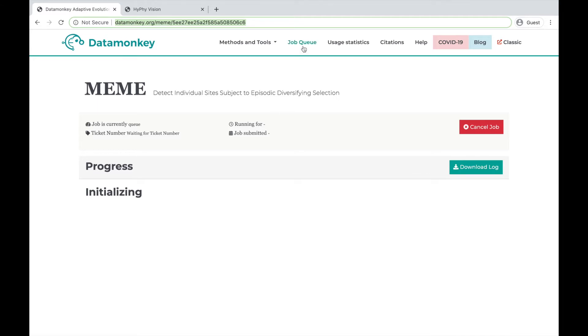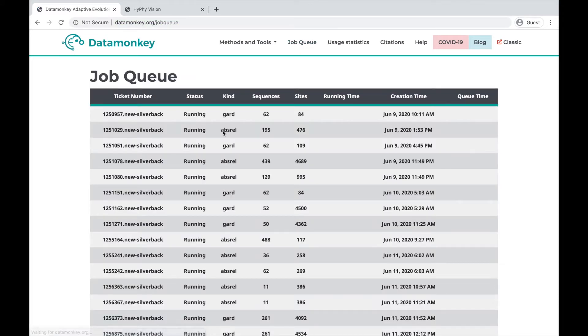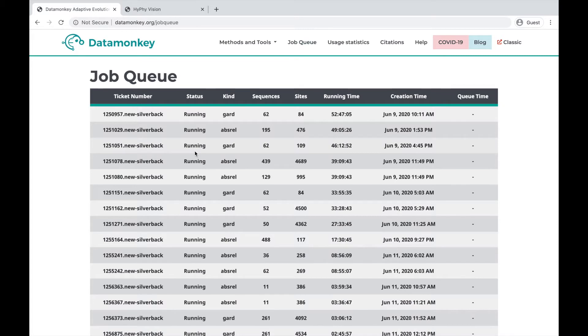You can also click on the job queue here to see all of the jobs that are currently running on Datamonkey.